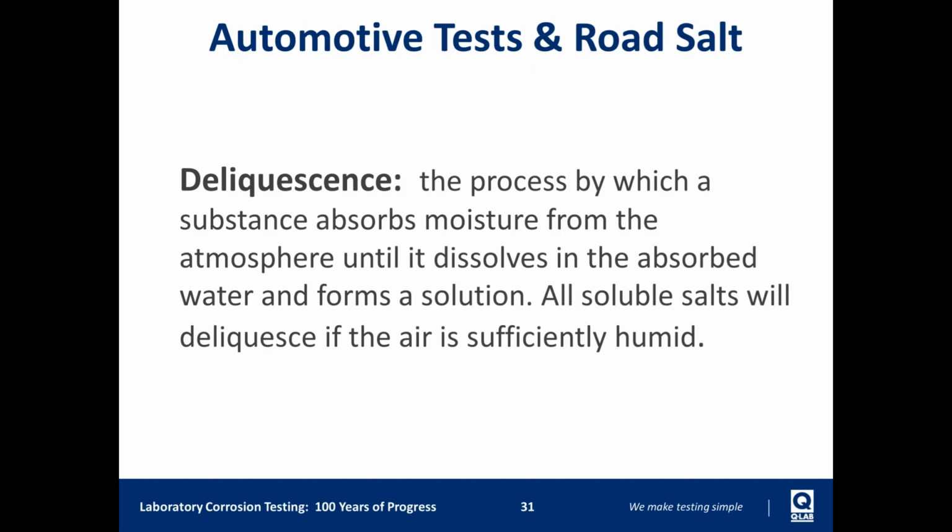The term that is used in these test methods is deliquescence. This is the idea that for salts, there's a certain relative humidity at which there's enough water vapor in the air for the salts to absorb that water vapor and become liquid. If you were to put table salt on a table in a very humid room, it would become liquid even though there's no condensation forming. That's the act of deliquescence.